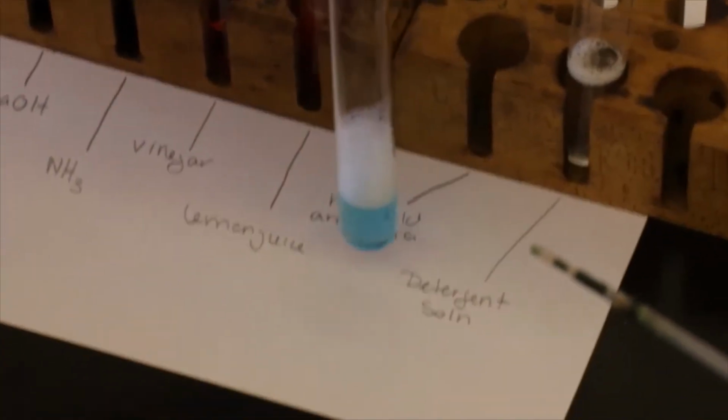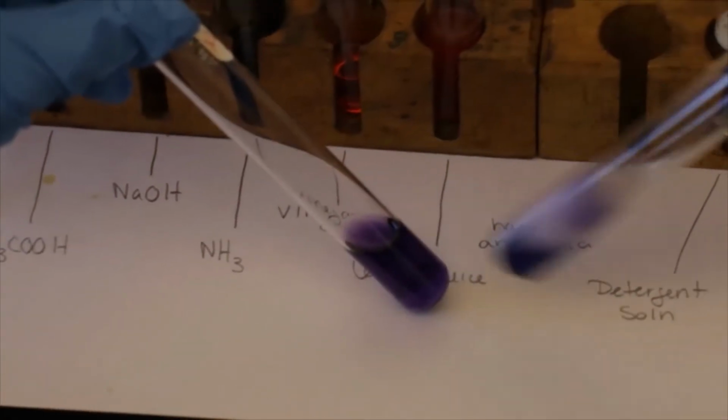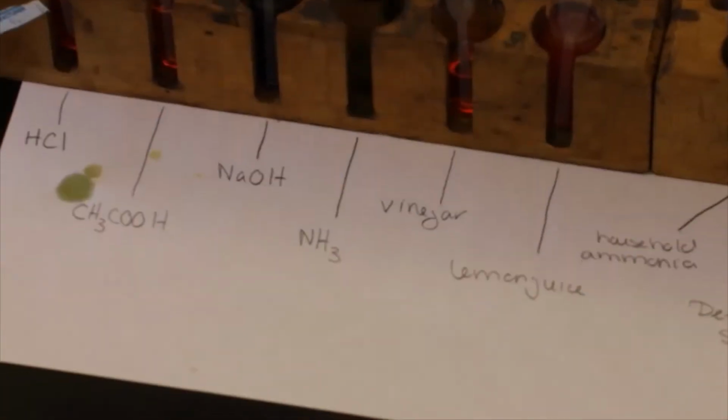And if we're looking at ammonia, it's a little hard, it's a blue solution to begin with, but let's add some ammonia in, our universal indicator in. I'm going to mix this to our ammonia, and we have a purple color. Ammonia is a base, has that slippery soapy feel, and here we are, a purple as compared to NaOH. This one seems a little more on the blue side. This one is more of like a lilac color. Again, NH3 is still this green color.